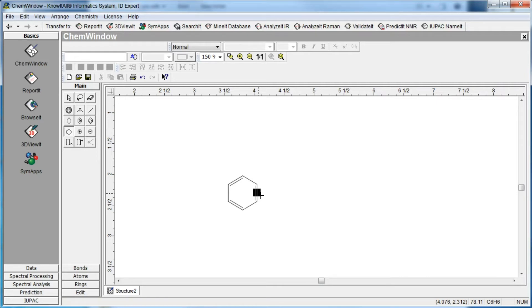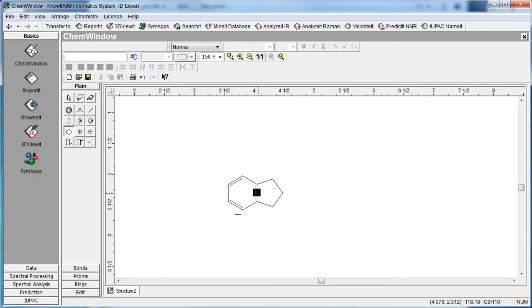Click the hitbox to join the cyclopentane ring to the benzene ring. Next, select the inside double bond tool, then use it to add a double bond to the structure.